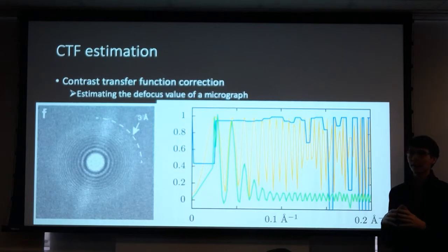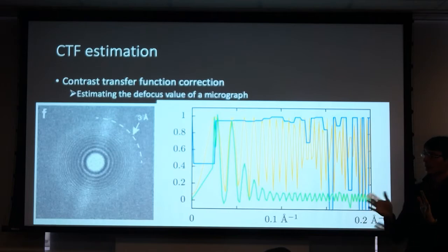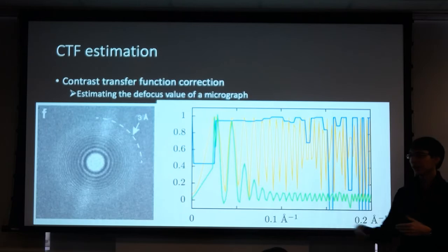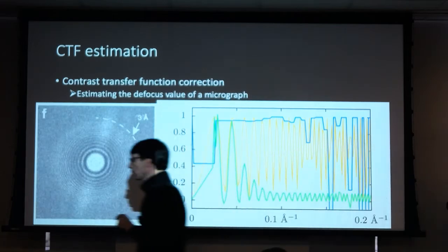And if all you can use to align your protein is actually alpha helices, you might want to have very low defocus values, or very small defocus values, to have as much signal in that 6 to 10 angstrom range where you see alpha helices. Okay, so you might have two advantages of going to low defocus.